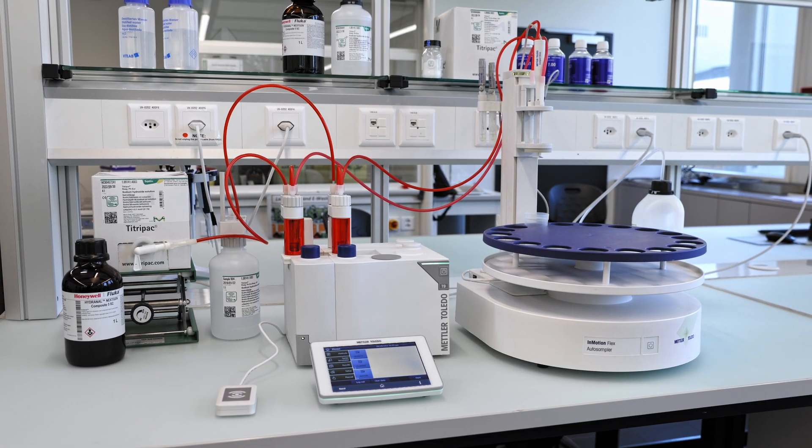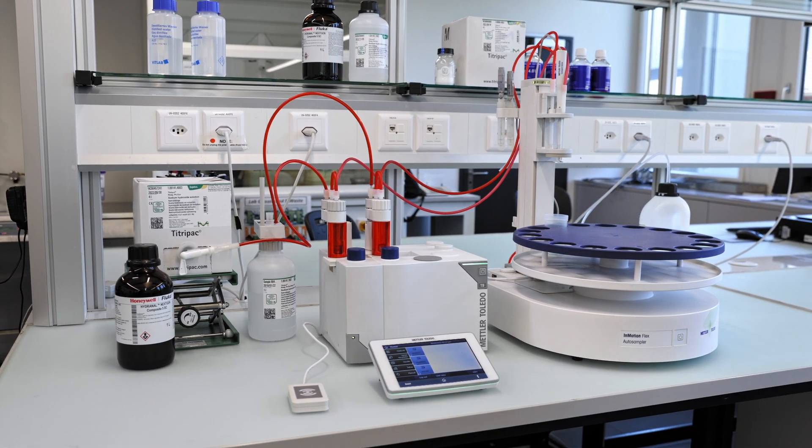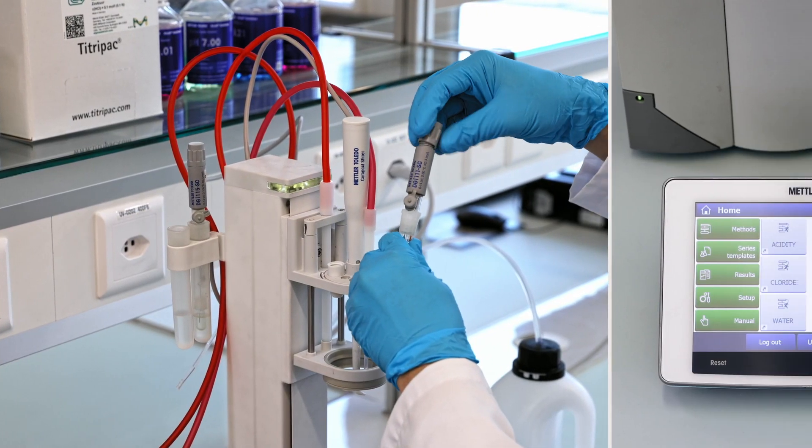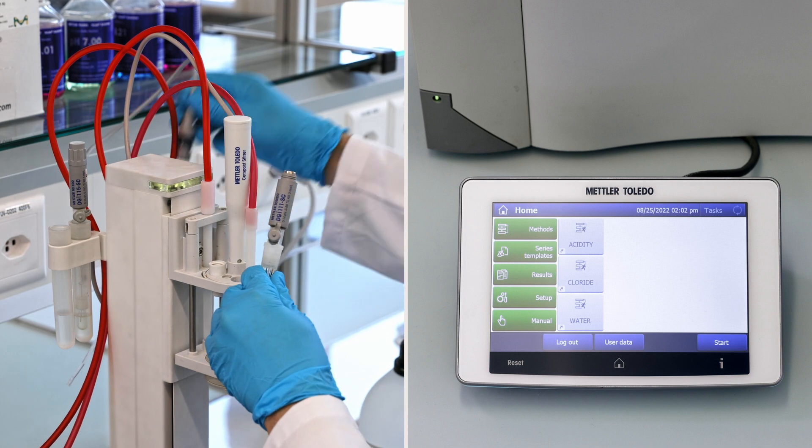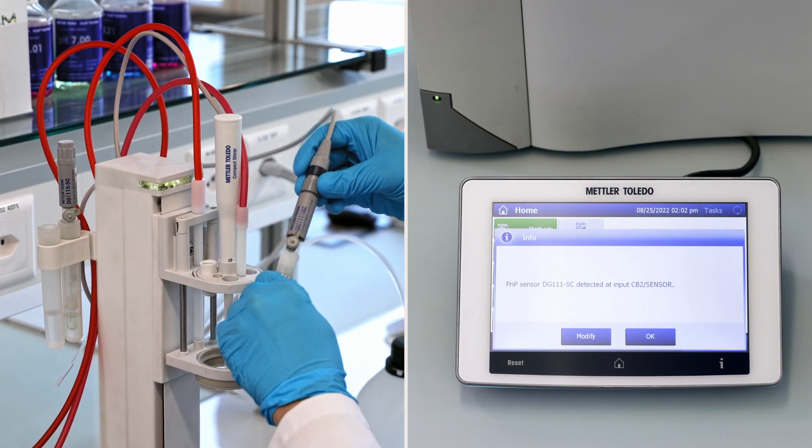Take the time to smarten up your titration workflows and bring yourself up to speed with your laboratory. No matter the application, plug-and-play barrettes and sensors are automatically recognized and ensure a smart and quick setup.